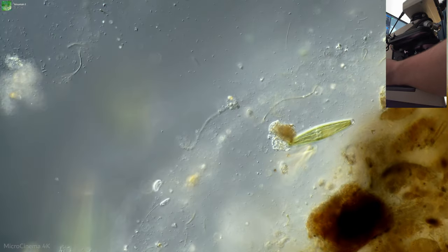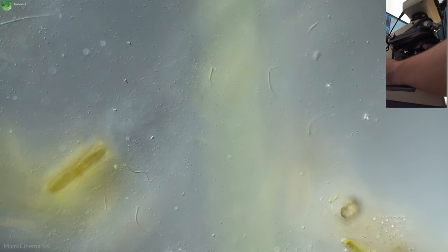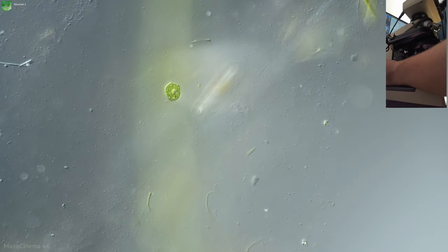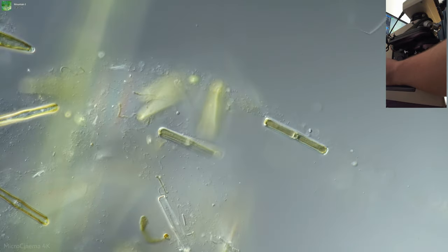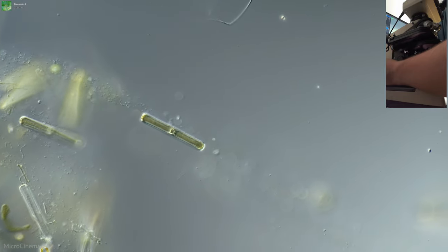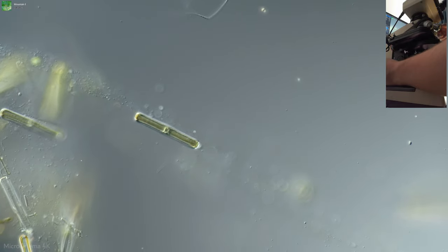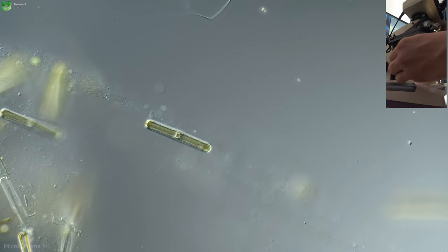And so there we go. Let's see, I think we can come up a little bit more, drop the contrast down. And yeah, this is a deep well slide by the way. So I'm actually kind of going well beyond what I ought to be doing, but yeah, we get great results like this. I think this looks like Pinularia swinging by here.